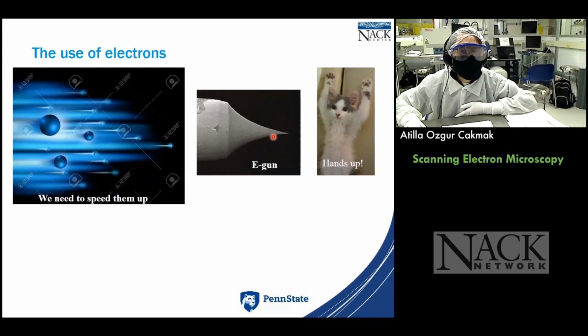Why is it metallic? Because metals, as conductive materials, are rich in electrons, okay? So we will be able to release several electrons from this electron gun thanks to that. And why is this particular shape? We'll talk about it in a second.